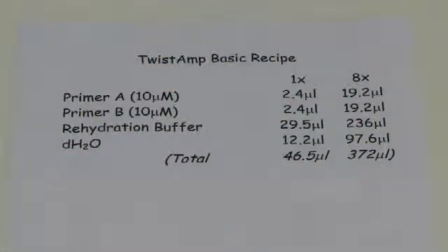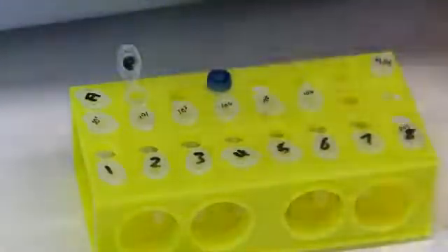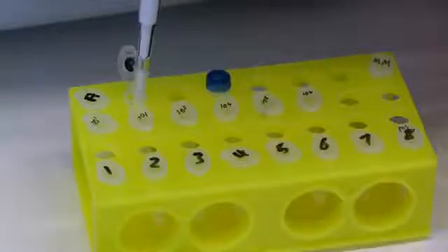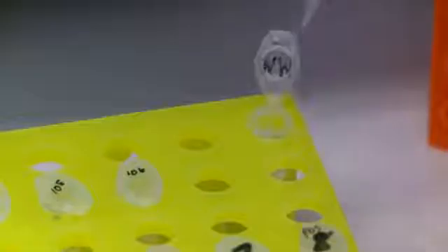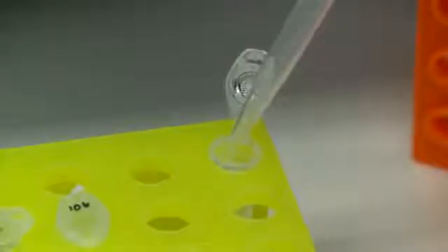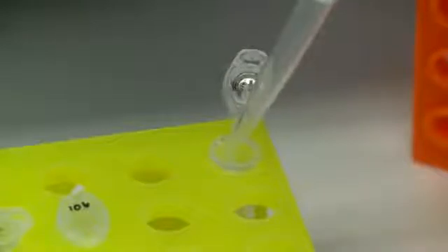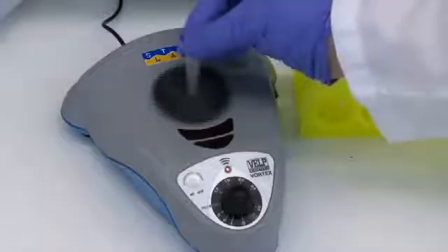Write down your MasterMix recipe so that you ensure you make enough MasterMix for all your reactions, with some in excess. Label a tube for your MasterMix. In your MasterMix tube add your primers, rehydration buffer, and water. Vortex and centrifuge.